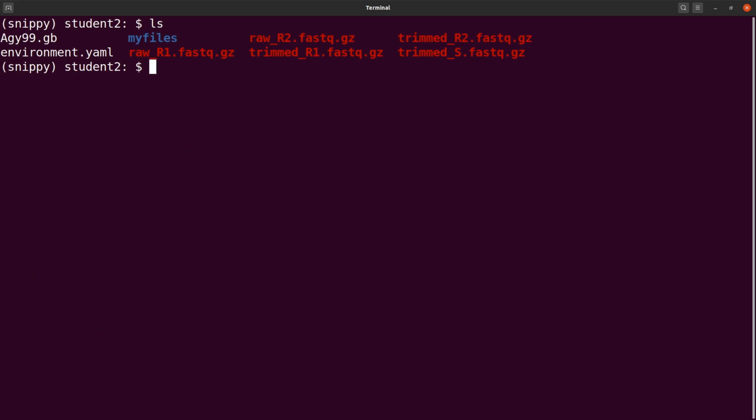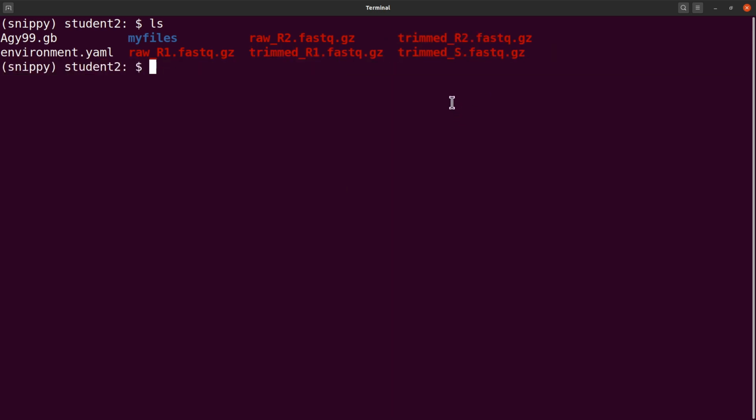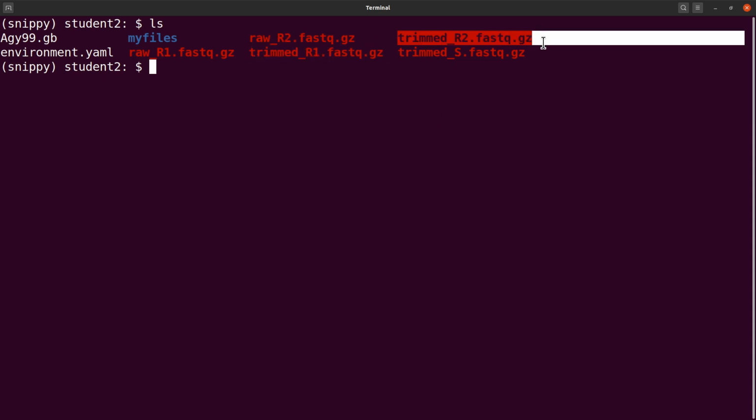Before we proceed, I made mention that with the fastq files, we will use forward and reverse. If you look at what we have here, we have forward, we have reverse, we also have single end reads. Single end reads may be useful in some cases, but generally we use the paired reads to do the analysis, if you've done trimming.